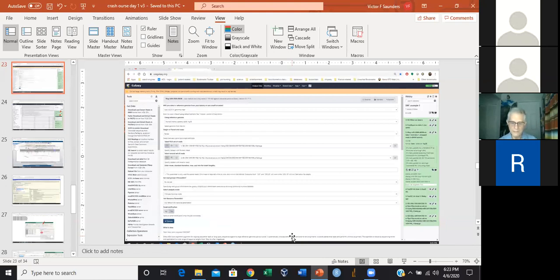It's not as much an inference process as getting the most likely sequence alignment. And it's inference only in the fact that you need to go through a logic tree in order to get through this massive pile of pieces.